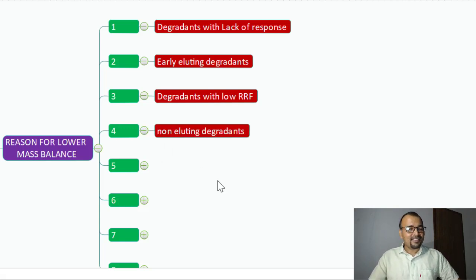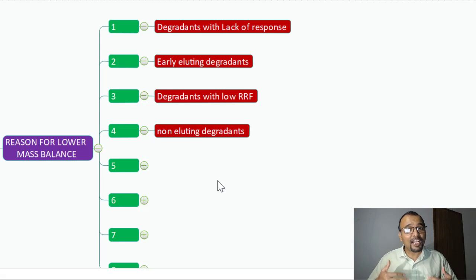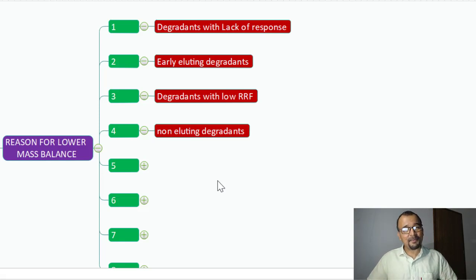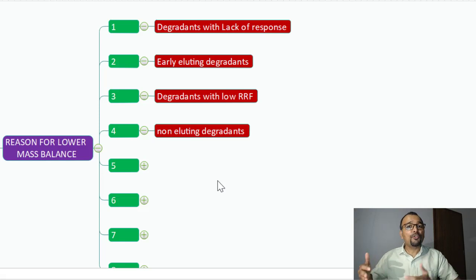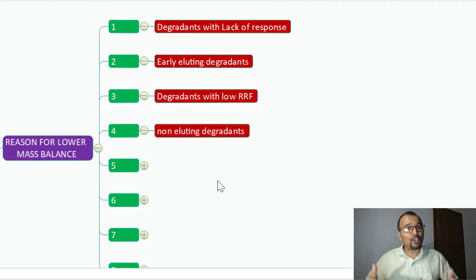Non-eluting degradants. If your degradants are highly non-polar and you are running reverse-phase chromatography, and if these degradants are not eluting out of the column because they have a very strong affinity toward the stationary phase, you will end up losing them during quantification and fall short of the mass balance.